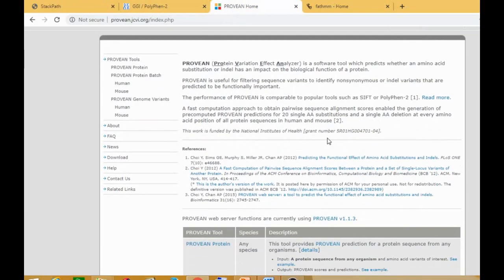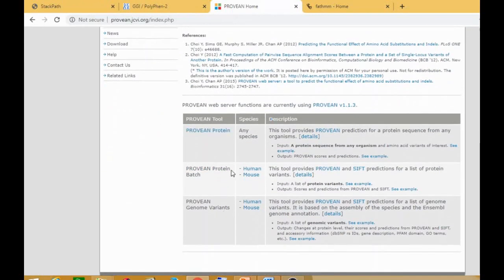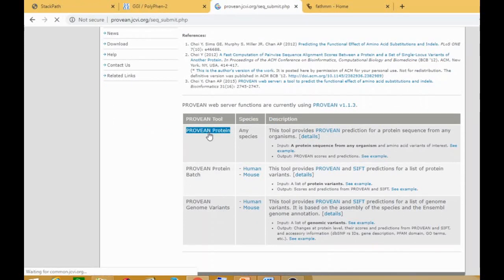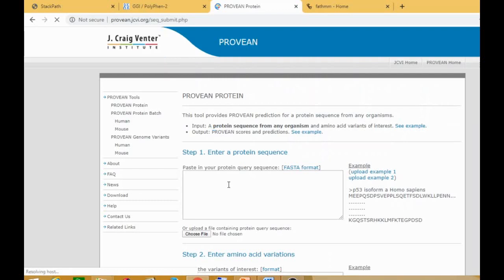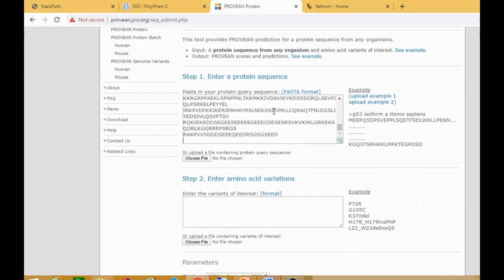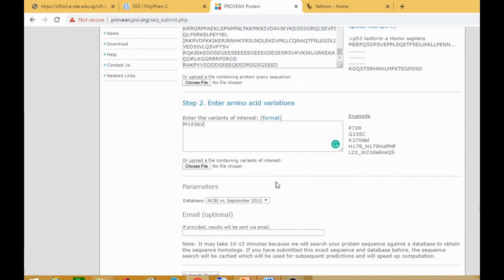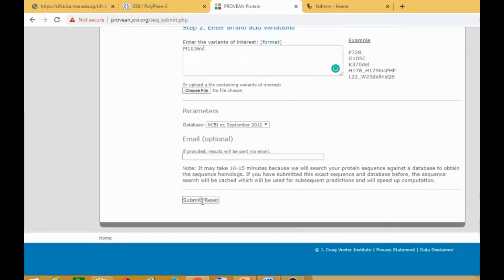Now for Provean. In Provean, there are three options — you click on 'Provean Protein.' Once you click on this, paste your protein query sequence — same as before — just paste your protein sequence here. Enter the variants of interest: M1036V. Then click Submit.